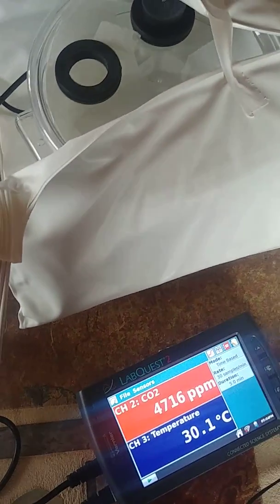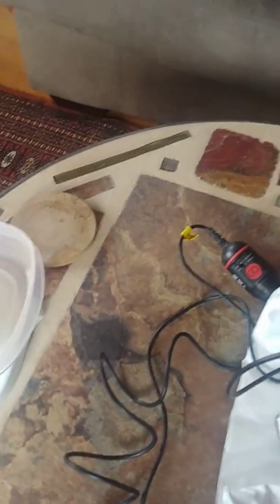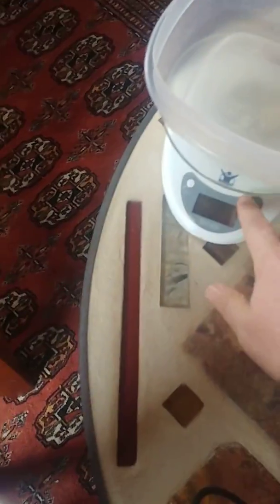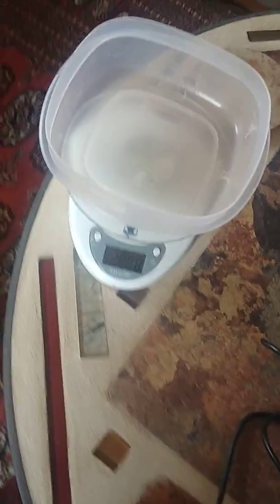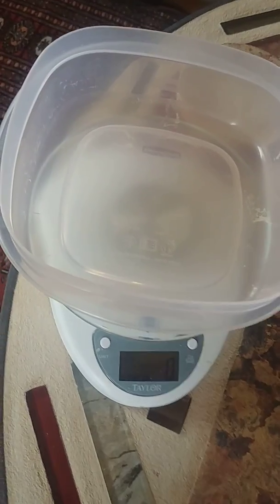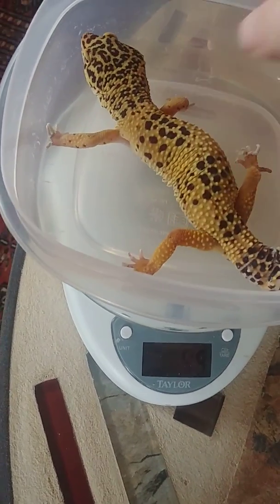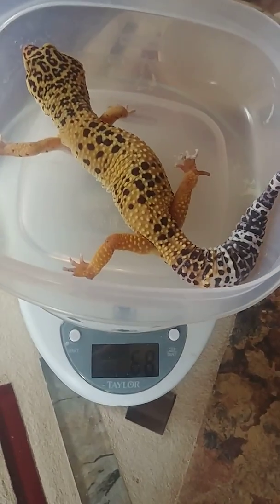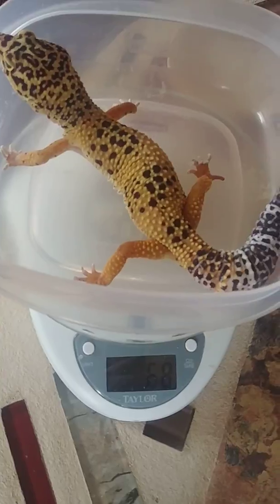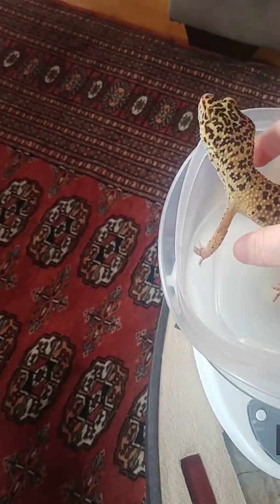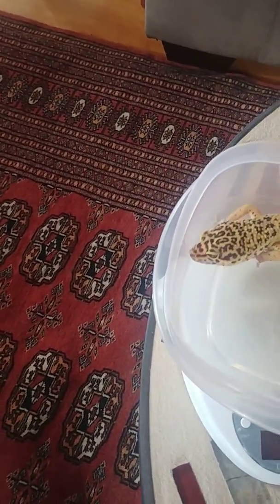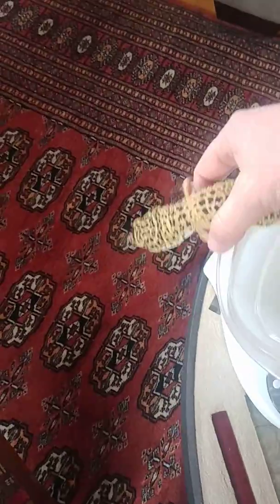So the first thing we need to do is actually weigh our animal. And Wallace is pretty active right now so I'll see if I can get him to cooperate. I got a little scale here. So we're going to weigh Wallace. And he weighs 68 grams. So let's just see if he'll just hang out in the scale. Nope. He's being very, very active.